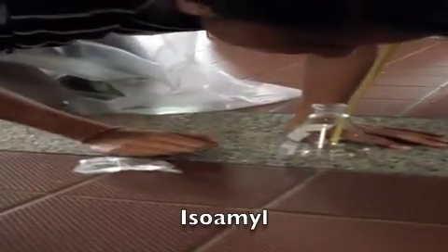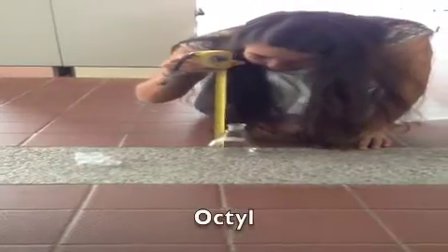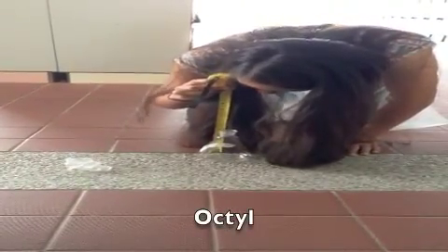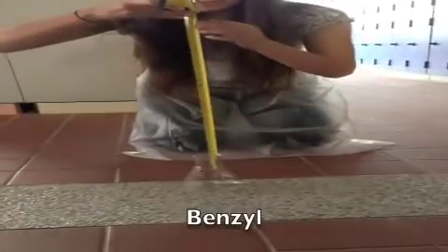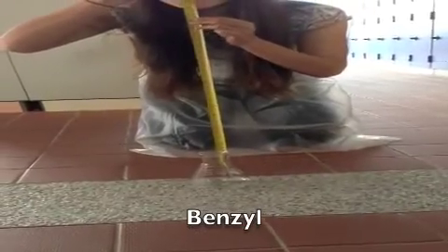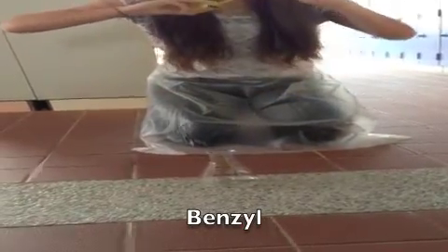We then placed the flask onto a hot plate and turned the temperature to 45 degrees Celsius and turned the stirring speed to 3. We left the flask on the hot plate for 3 minutes and then carefully placed the flask into an ice water bath to allow the reaction to cool down for a few minutes. We then repeated the procedure with other alcohols.